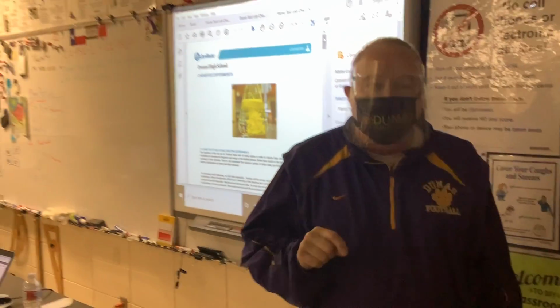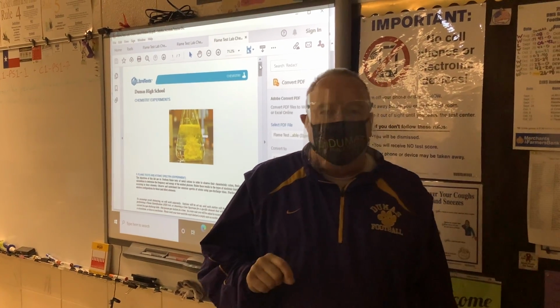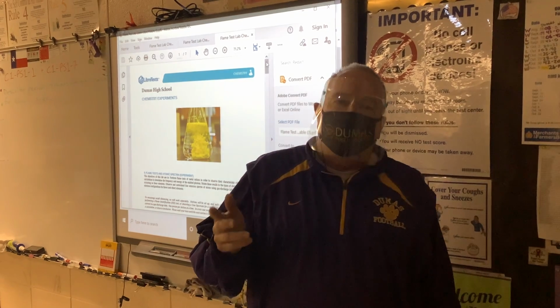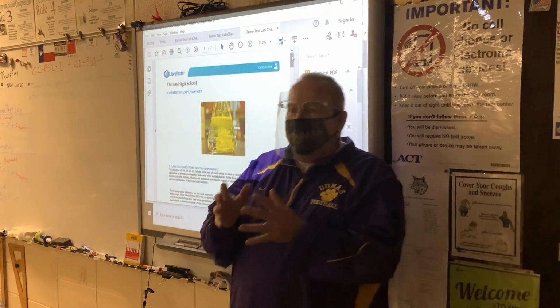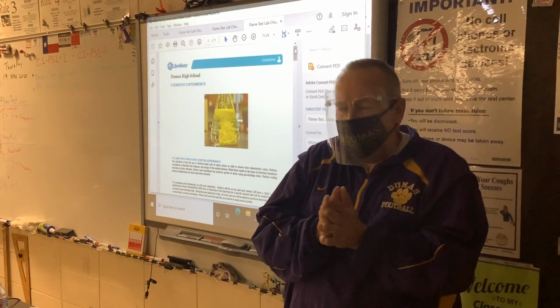where we start to examine the group 1 and group 2 elements, the alkali metals and alkaline earth metals from the periodic table, and their properties. One thing we'll do is flame test. We'll also look at some of their chemical properties and how they react. But right now, let's talk about our flame test, specifically as it relates to atomic structure.